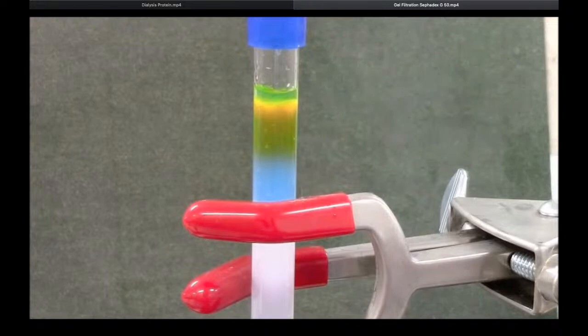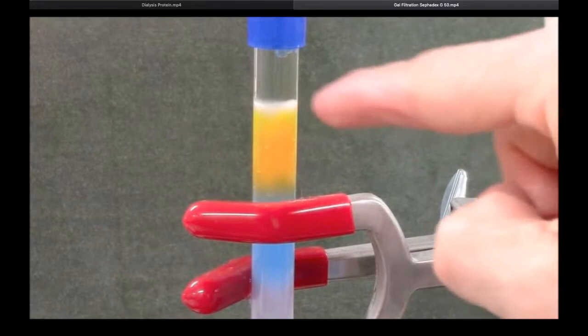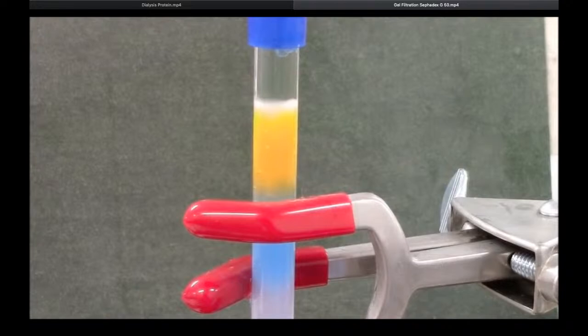So now the separation has proceeded somewhat. I'm going to try to add a decently large volume this time of buffer on the top, about a milliliter would be great. If I do this well, then the buffer that I put on top remains colorless because all the colored molecules have already gone into the gel. Alright, now you can start to see a little colorless layer on the top. That's perfect. All the colored molecules are in the G50 and they're starting to separate quite nicely.